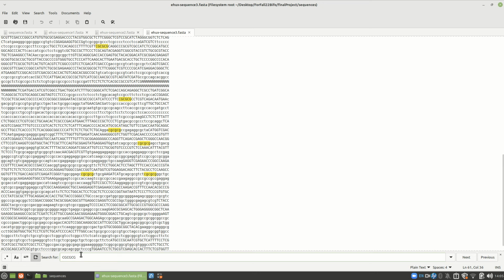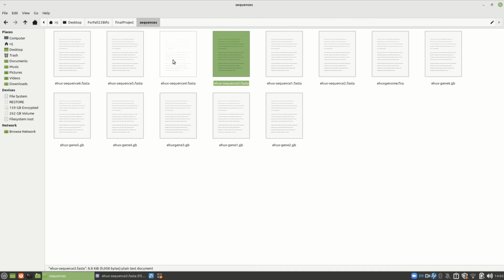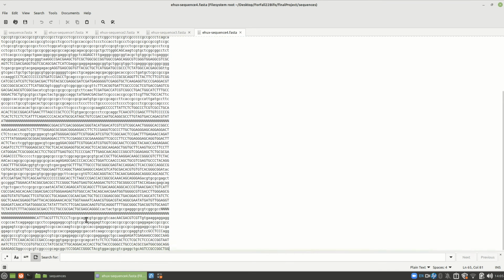You get to see how difficult this can be. The computers just guess, and it's hard enough. There's no way. They just guess. So now we go on to sequence 4. And ooh, this is just looking ugly. This beginning part is just ugly. And we get some ends, but we get some good sequence in between the ends. So let's see what we see here.